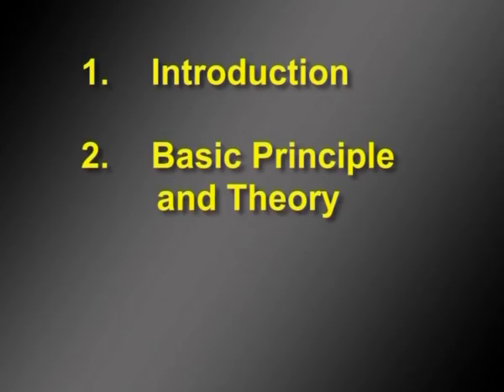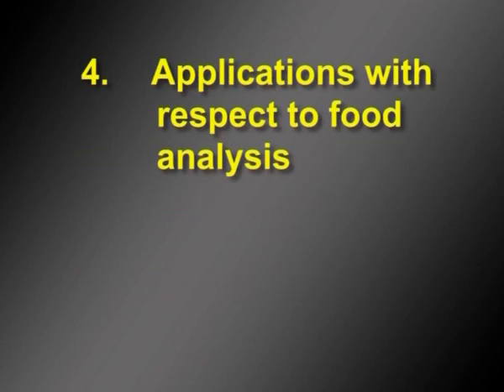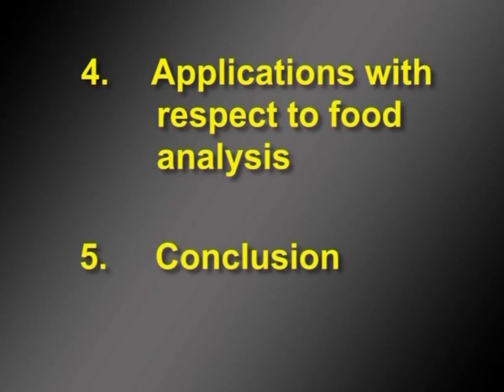In today's lecture, we deal with the topic entitled spectrophotometer. The present episode consists of the following 5 sections: introduction, basic principle and theory, instrumentation, applications with respect to food analysis, and conclusion. Let us see one by one.